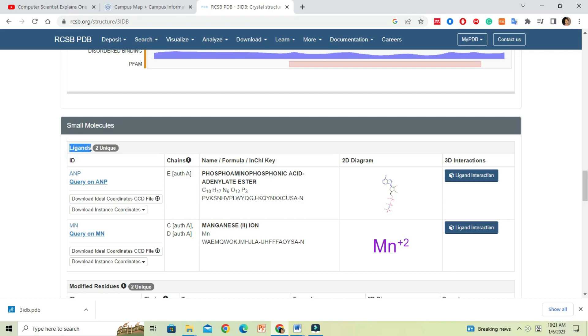To get the structure details of the ligand, we can copy the name and search in PubChem website. Go to PubChem and paste the name of the ligand in the search bar.